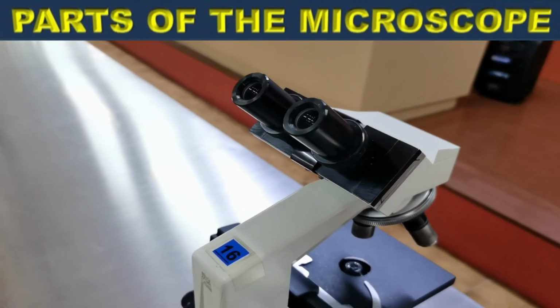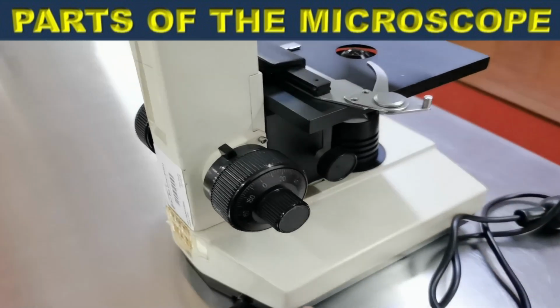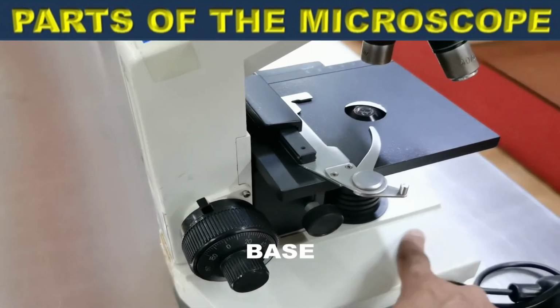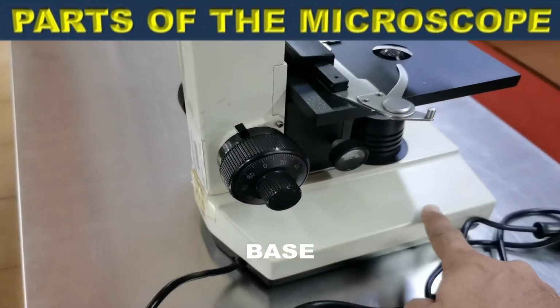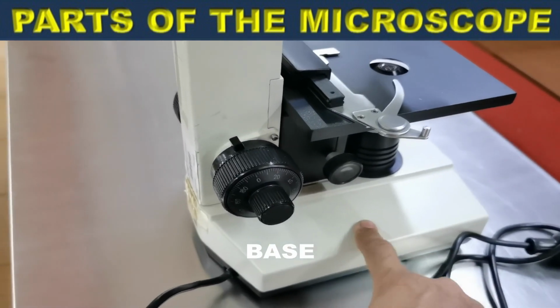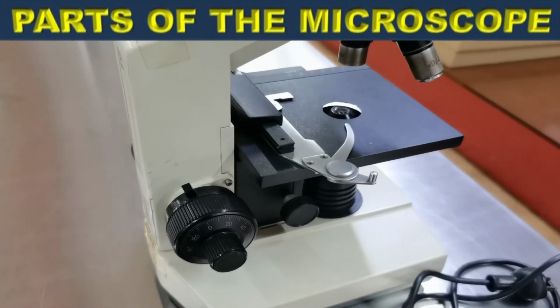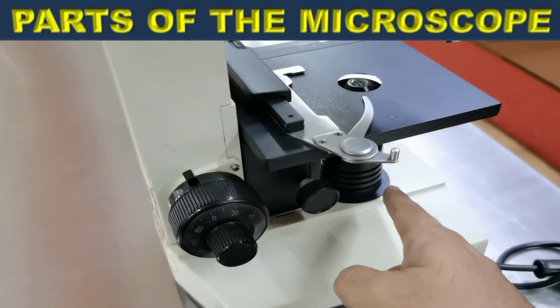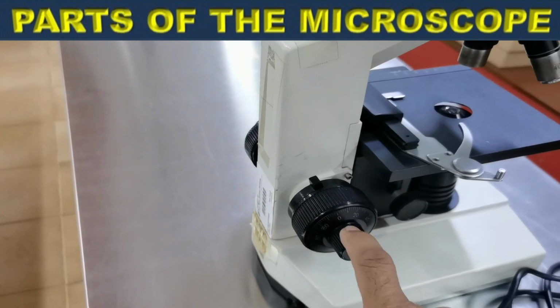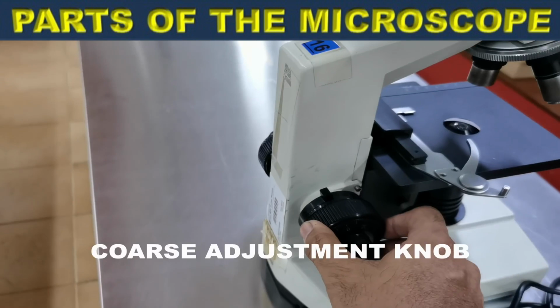Alright, so the entire microscope is supported by this part right here called the base. So this is the base of the microscope. The base supports the entire instrument, and in this case, the base of this microscope also contains components, especially the light bulb for this microscope. Alright, then here we have two adjustment knobs. So we have here the coarse adjustment knob.